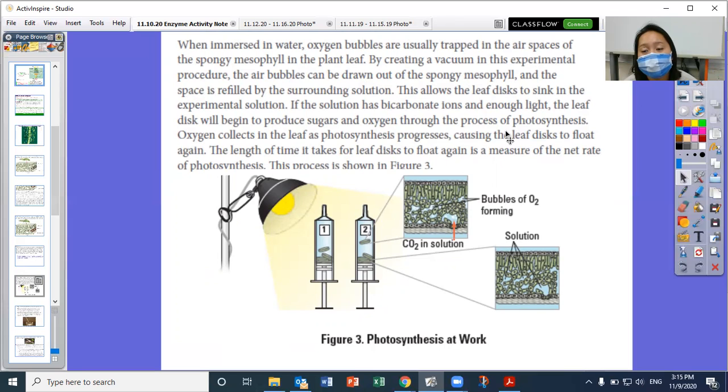Now, I'll be able to tell if I succeeded or not based on whether or not the leaf discs all fall to the bottom of the syringe. And if I didn't, I can try 1 or 2 more times. But if I keep trying, it's actually going to bruise the leaves and destroy the capillary internal systems of them. So then I would be forced to go and puncture more and then start all over. So the idea is to try to get it on the first try. So you pull down the syringe and then hold it for about 10 seconds, and I will demo that shortly.